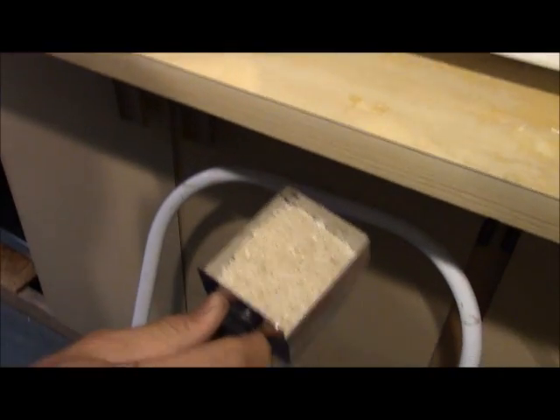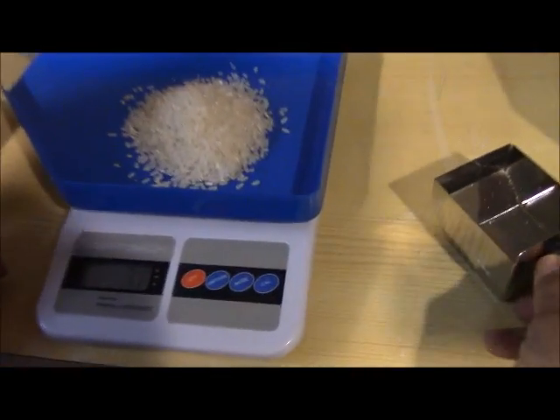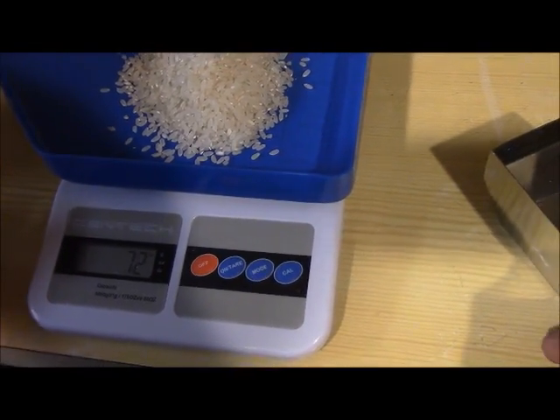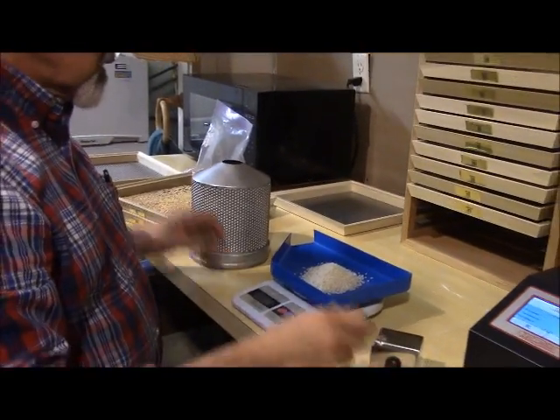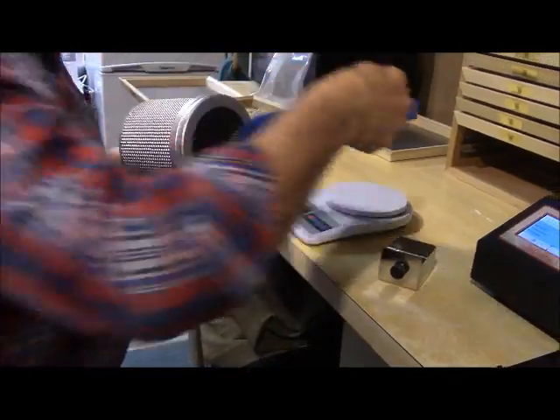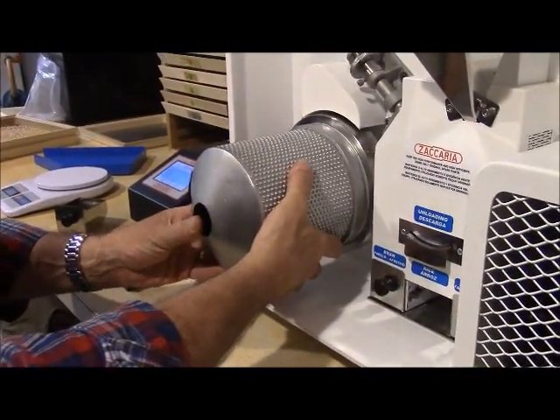Here is the whole rice sample. We're going to weigh it to get our percentages of 100. That's 72 grams of whole rice. We're going to then take that and run the indented cylinder separator to take out the brokens.